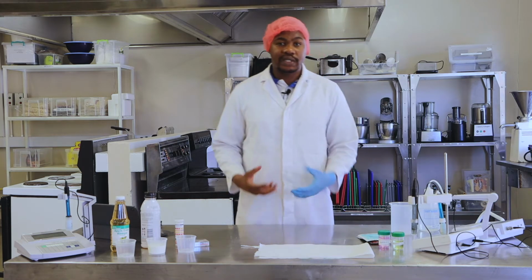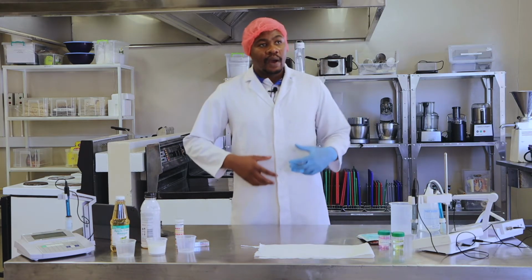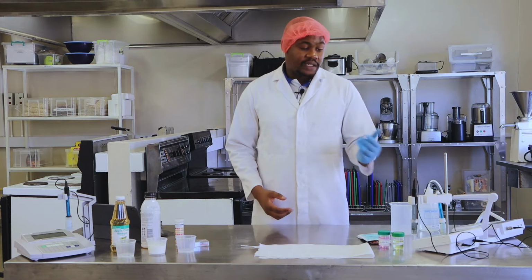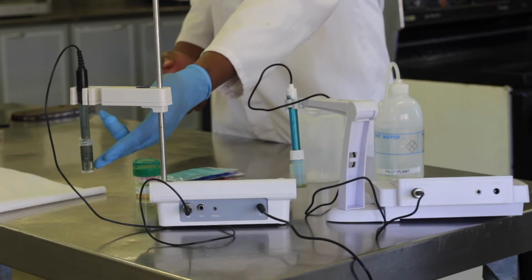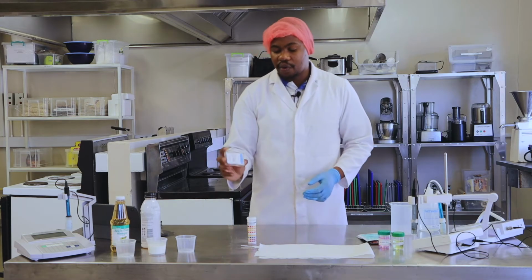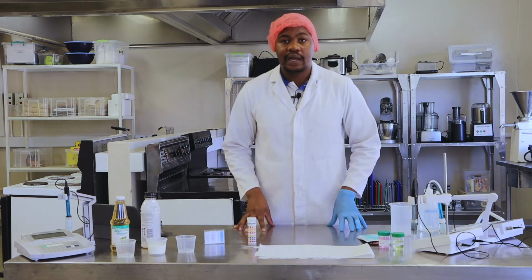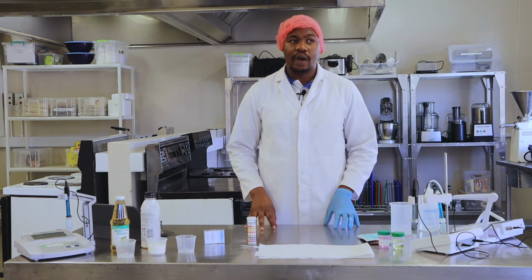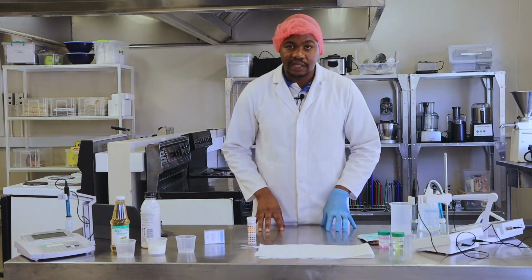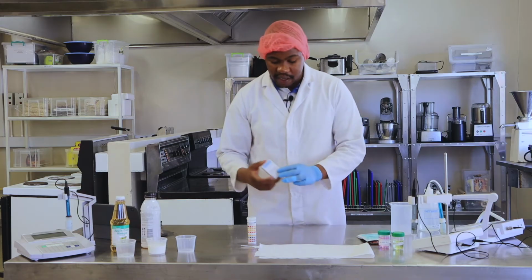So what are the tools that we can use to measure pH in food products? We use instruments such as a pH meter over here, and we also have test strips, and litmus papers. Each of these tools gives you a reading or an indicator of what the pH is in your food product. But let us start with the papers or the strips.